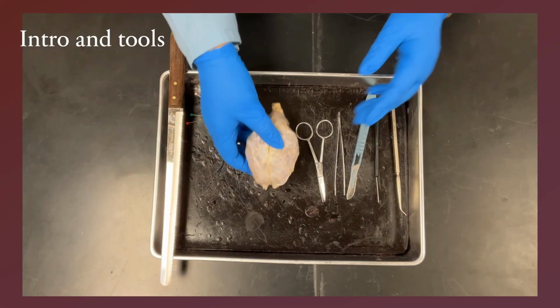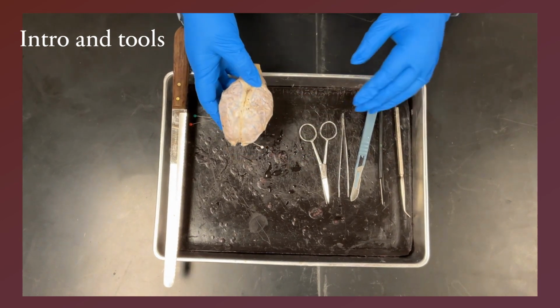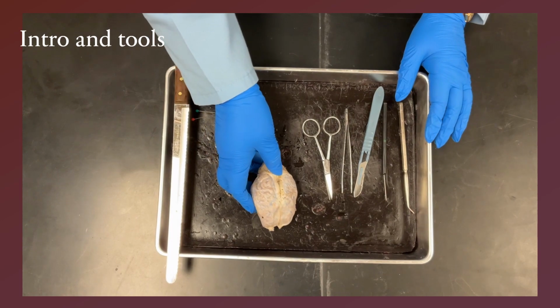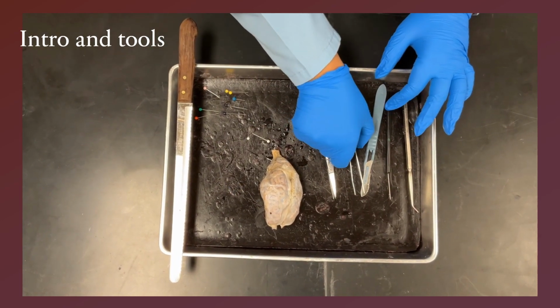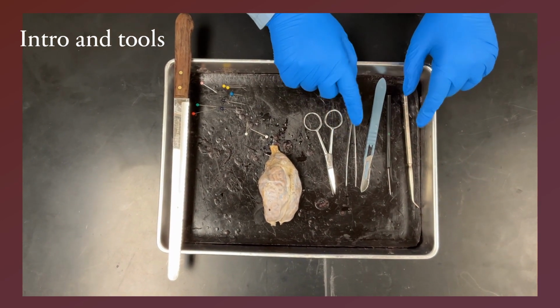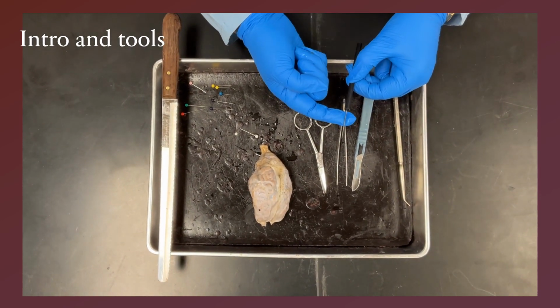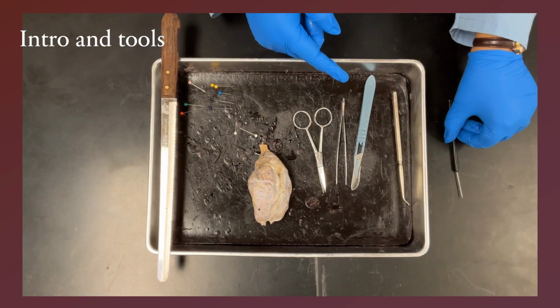We will do a sheep brain dissection today. First, I will show you what supplies we need. Of course, we need the brain, and then these are the tools. We need forceps, scissors. Two things we will avoid using: a sharp tip pointer. We will not use it because that damages tissue.